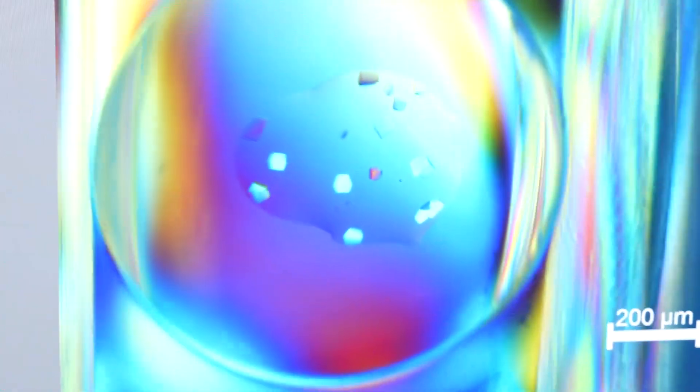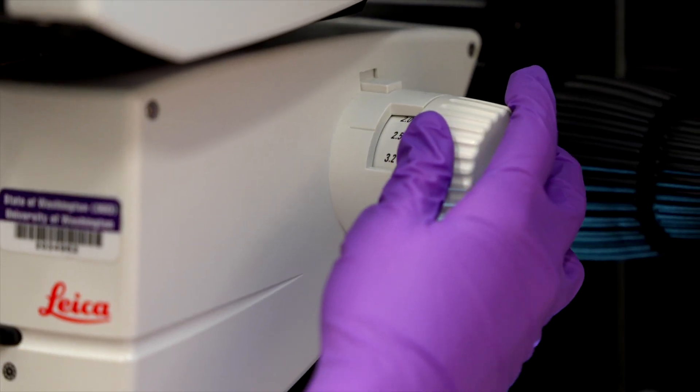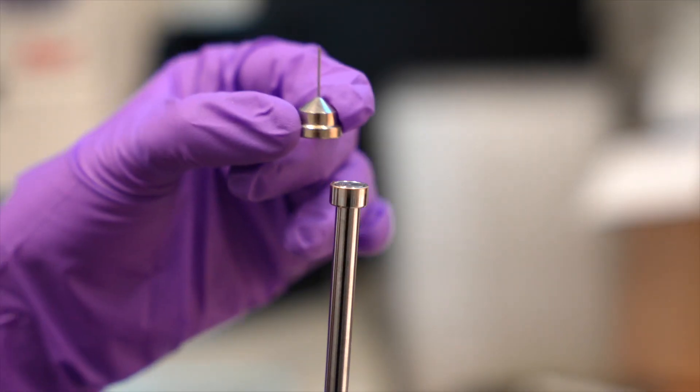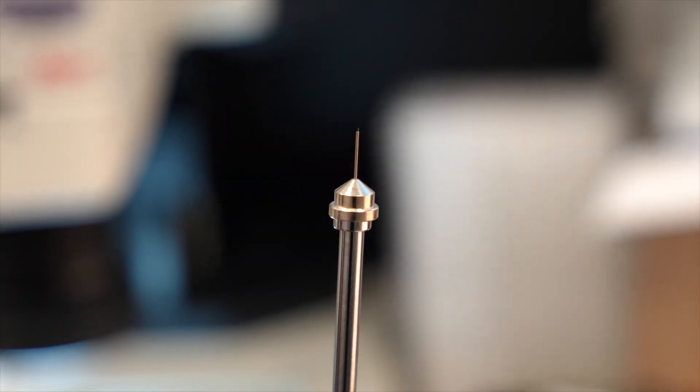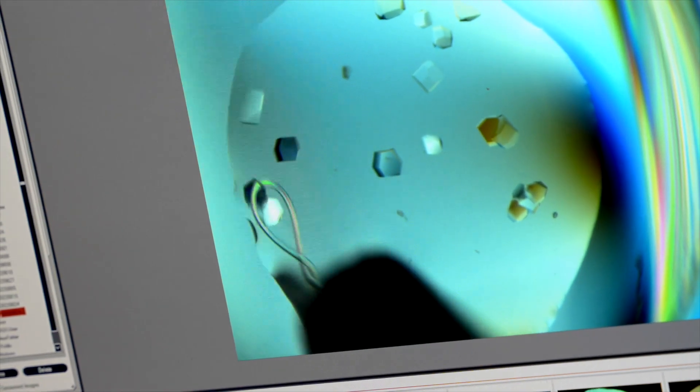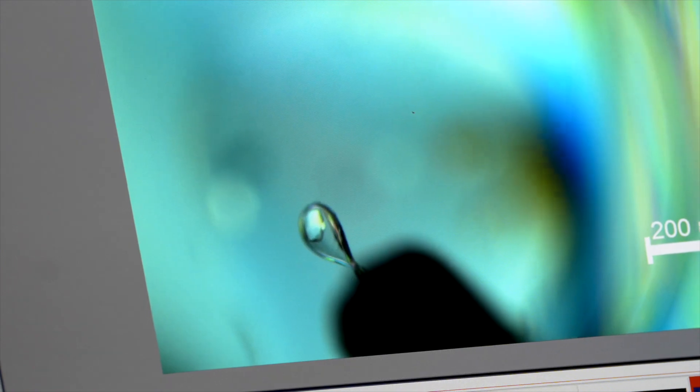It's a small crystal, but that's okay. There are still millions of protein molecules packed inside. The first step is to harvest the crystal. Because the crystal is so small, we use a tiny nylon loop that's less than a millimeter across to scoop up the crystal. This requires a steady hand, and we need to be pretty quick. Just like before, we have to watch out for evaporation, which could cause the crystal to disintegrate right before our eyes.